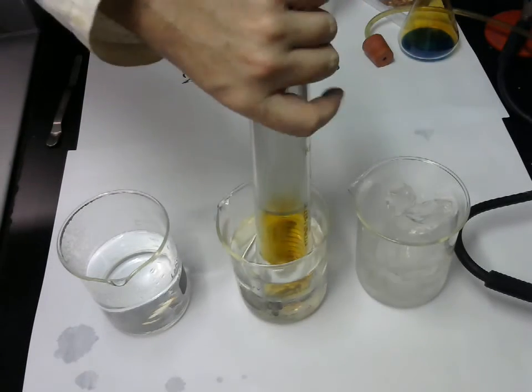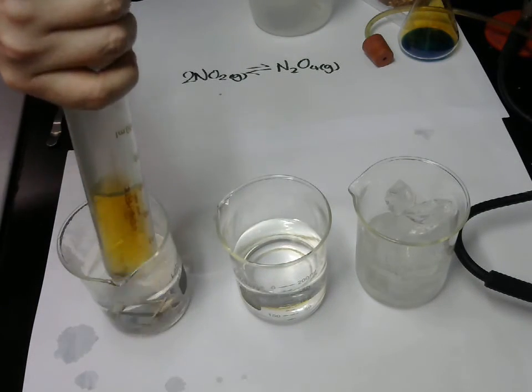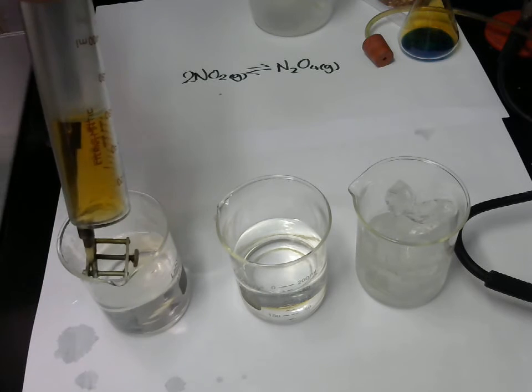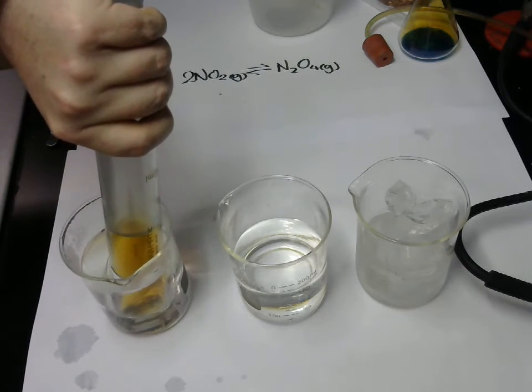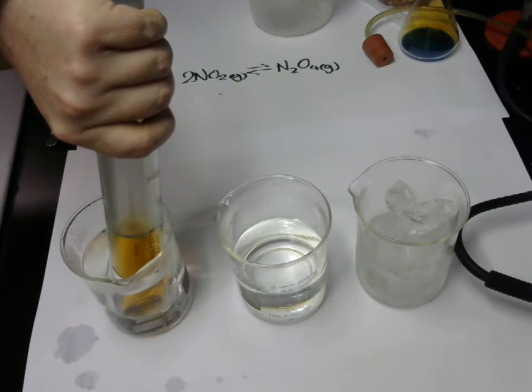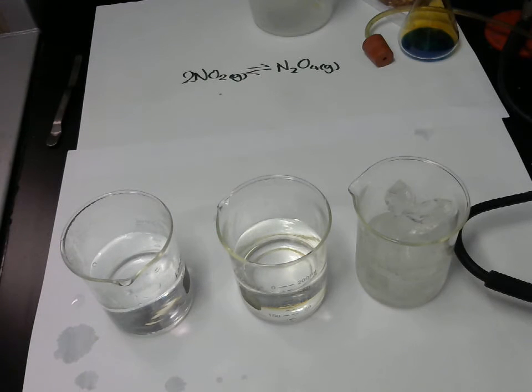Rightio, so I'm going to hold the syringe in position so that pressure isn't a variable. Because we expect in hot water particles spread out and it'll push against me, won't it? So I've got to stop that happening. Sorry, it says we've got to do this thing. We think it's darker or lighter? Darker, okay? So it's got darker by having heat energy added.